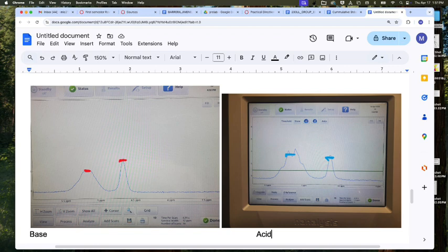What is height tied to? Say again? Integration. And what is integration? It's the amount of hydrogens represented by that signal. Okay? So in this individual mixture, if we assume homogeneity in both the starting sample and here, I could go through and compare the amount of that to the amount of that, and I could create a ratio of the 2-butene to the 1-butene.